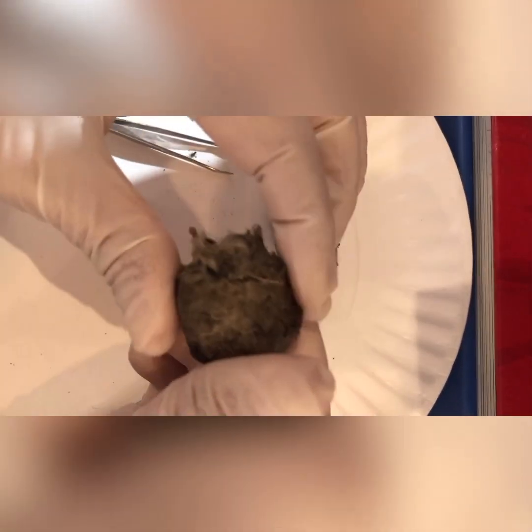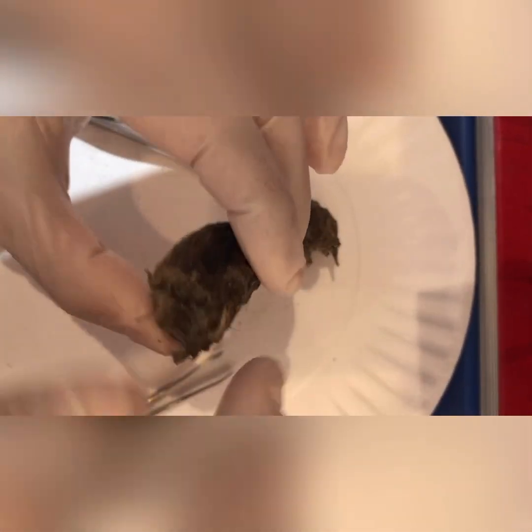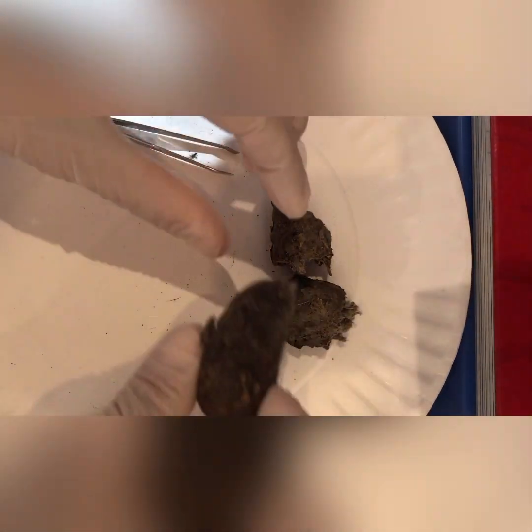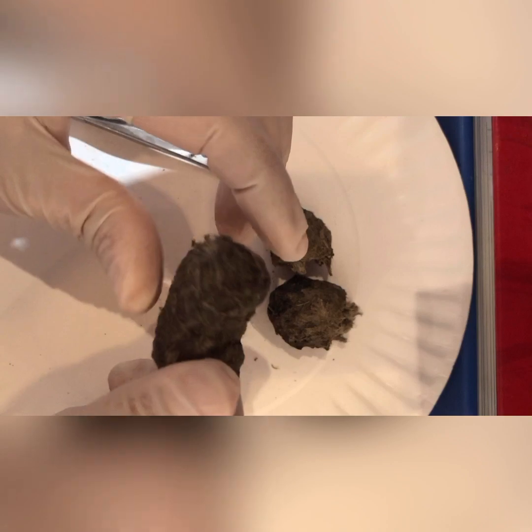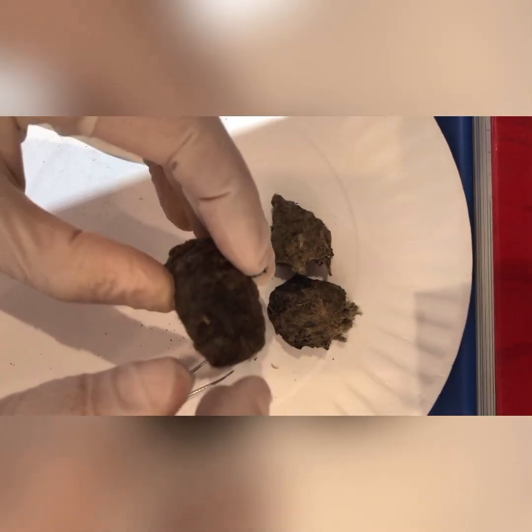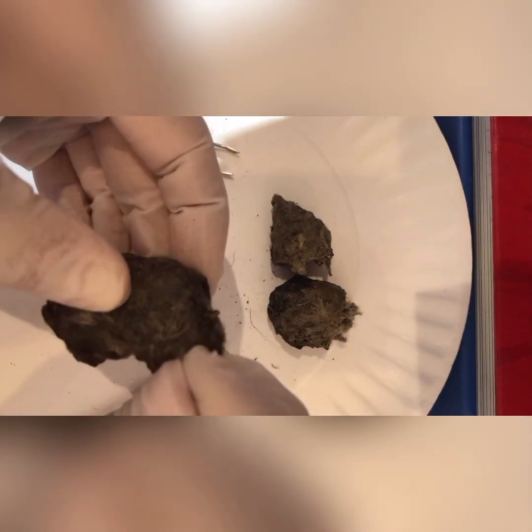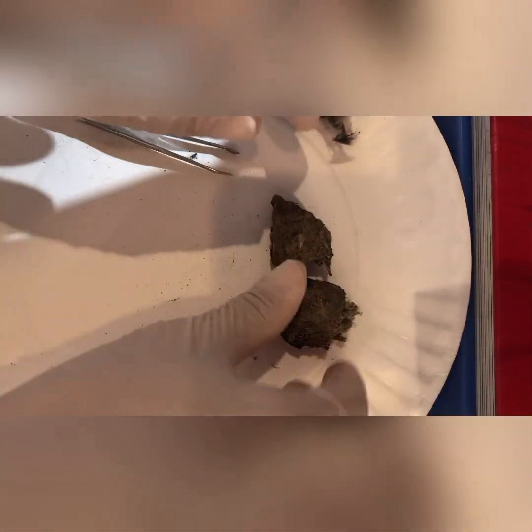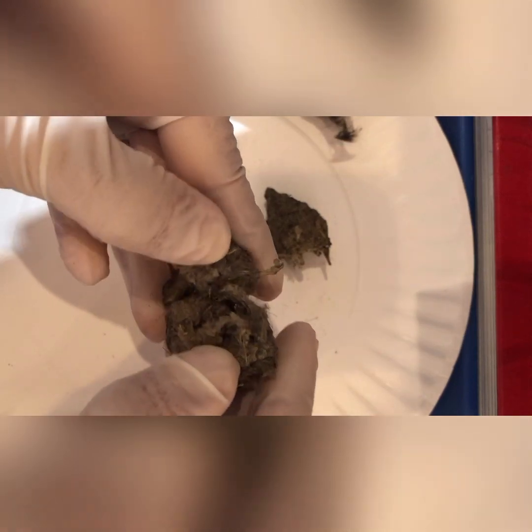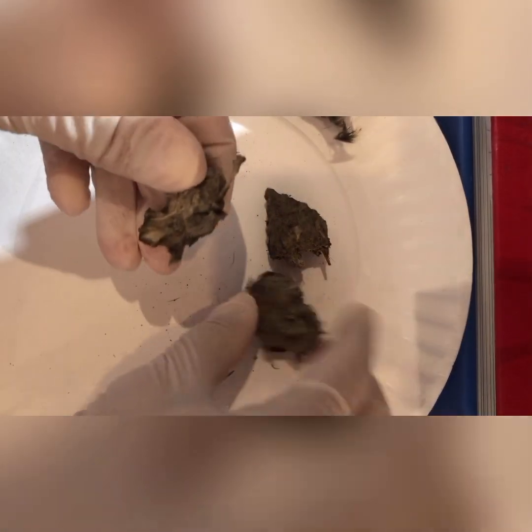What I'm going to do is look on the outside and notice, do I see any fur? Do I see any feathers? I do see fur, but does it look like we see any feathers? Nope, not on this one. I have another one that's whole too. This one also doesn't show any feathers. Oh, actually, it does. There is a feather right here. Is that feather or some fur? It's not feather, sorry. It is fur. So I'm going to put that one off to the side, and we're going to break it up a little bit more by hand and try to see what I have inside of my pellet.